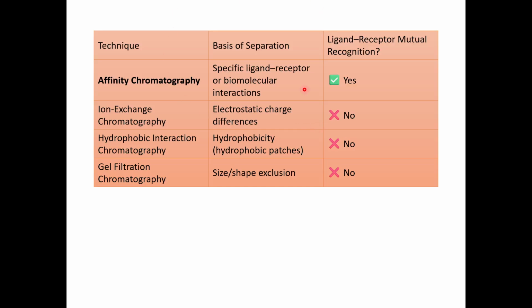So, this is a simple table which compares different types of chromatography. Your affinity chromatography, the basis of separation is specific ligand receptor or biomolecular interactions.